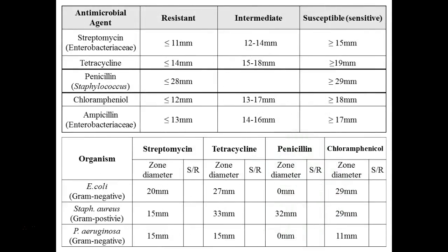We're not actually getting the actual concentration, right? That's already been pre-worked out for these antibiotic discs. They have a specific amount of antibiotic impregnated into them. So again, you'd have to measure, right? And then interpret based on the chart, whether it was sensitive or resistant or intermediate.